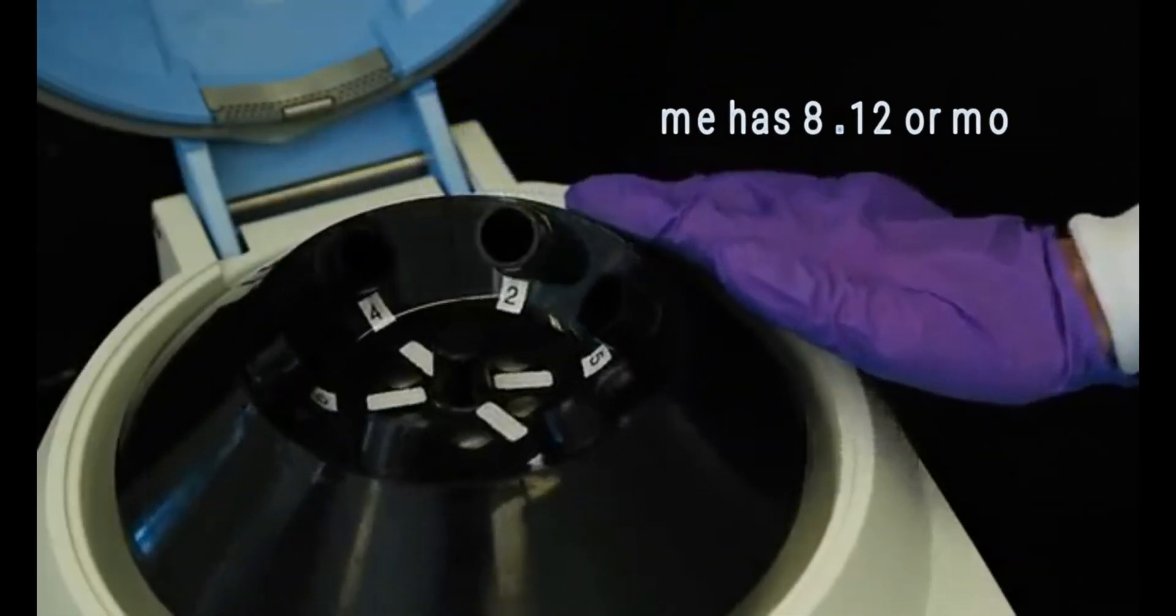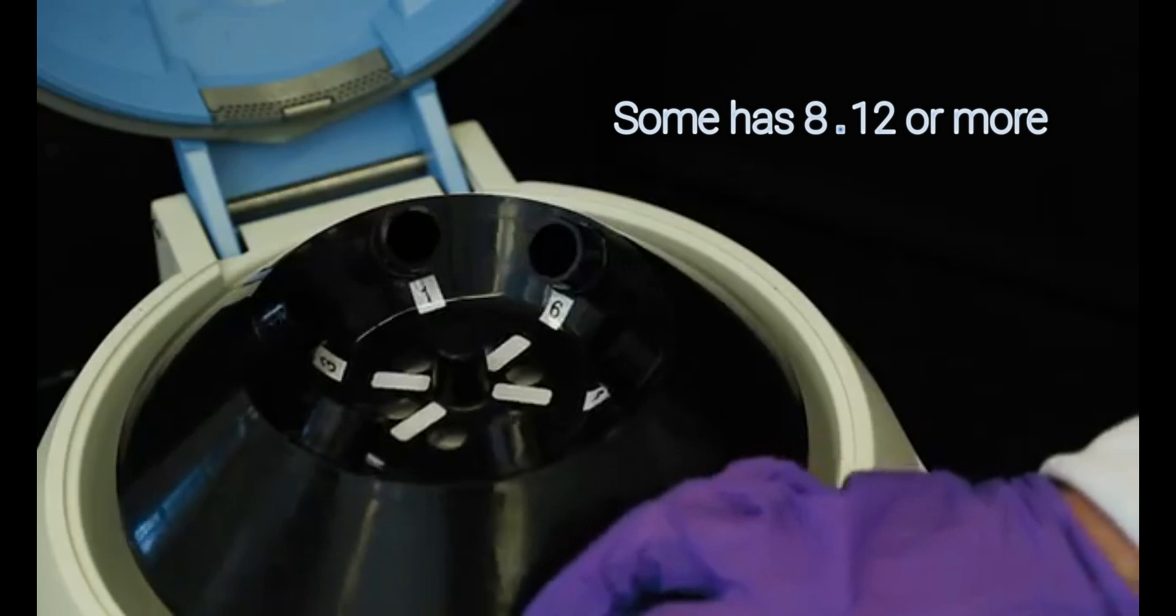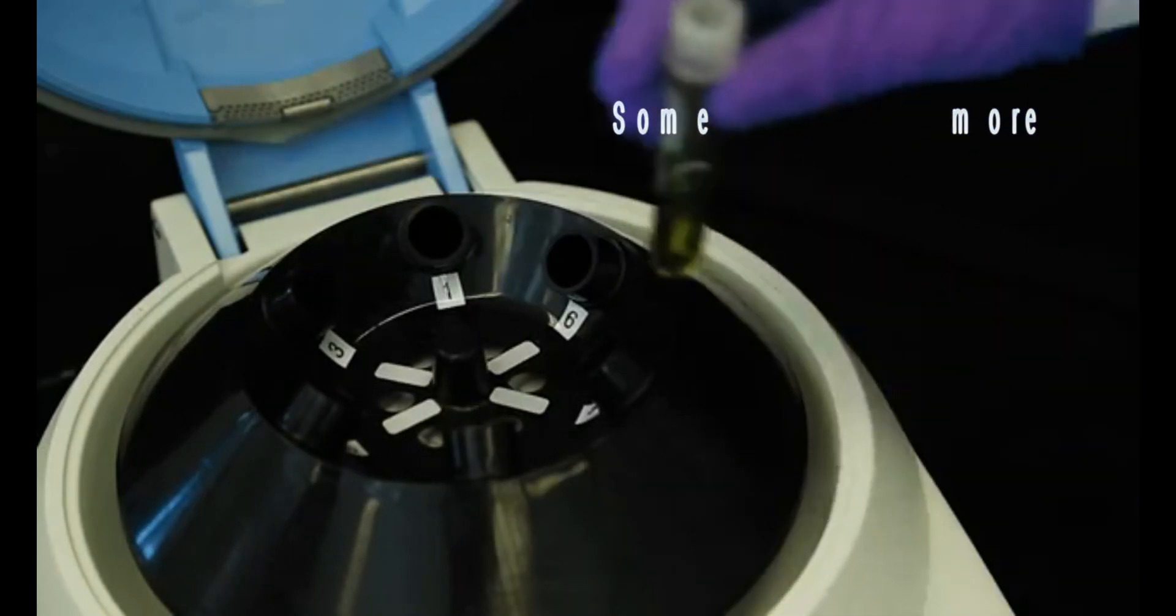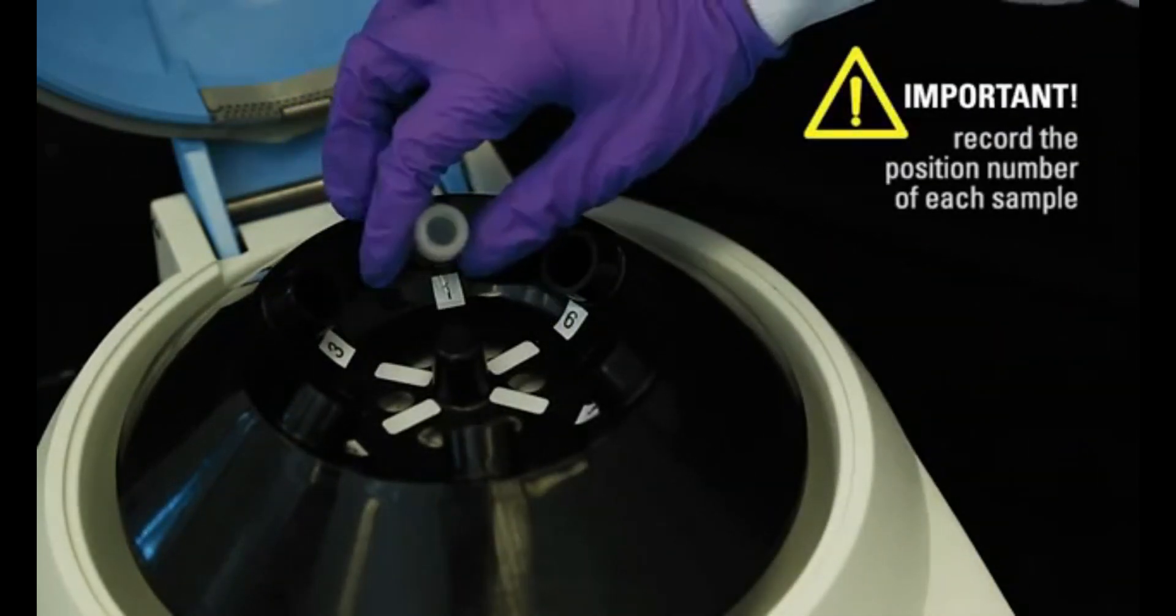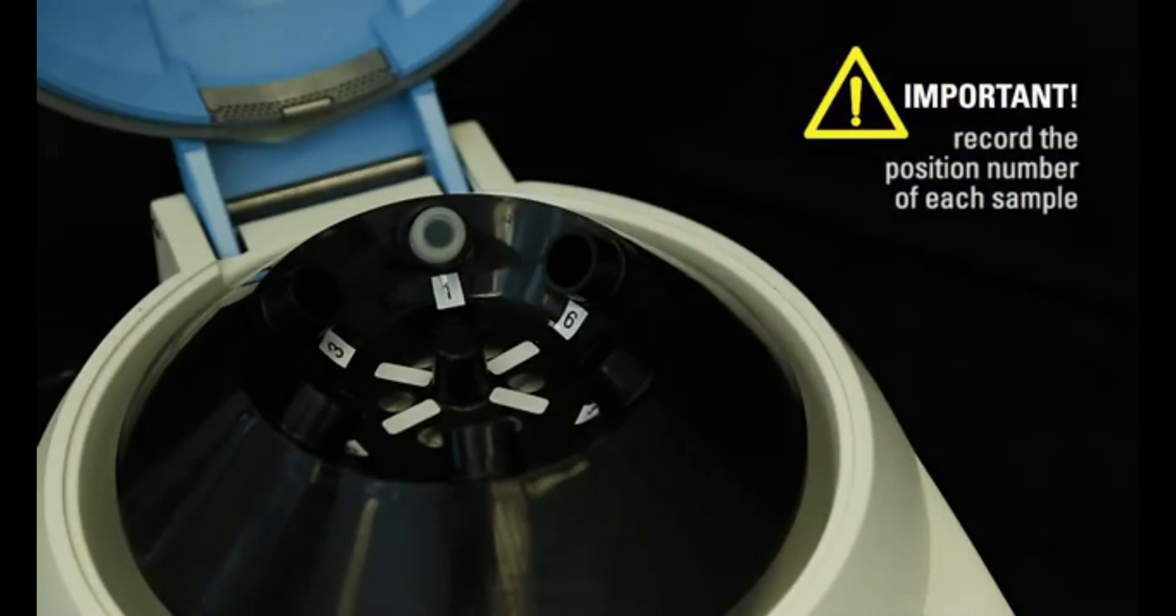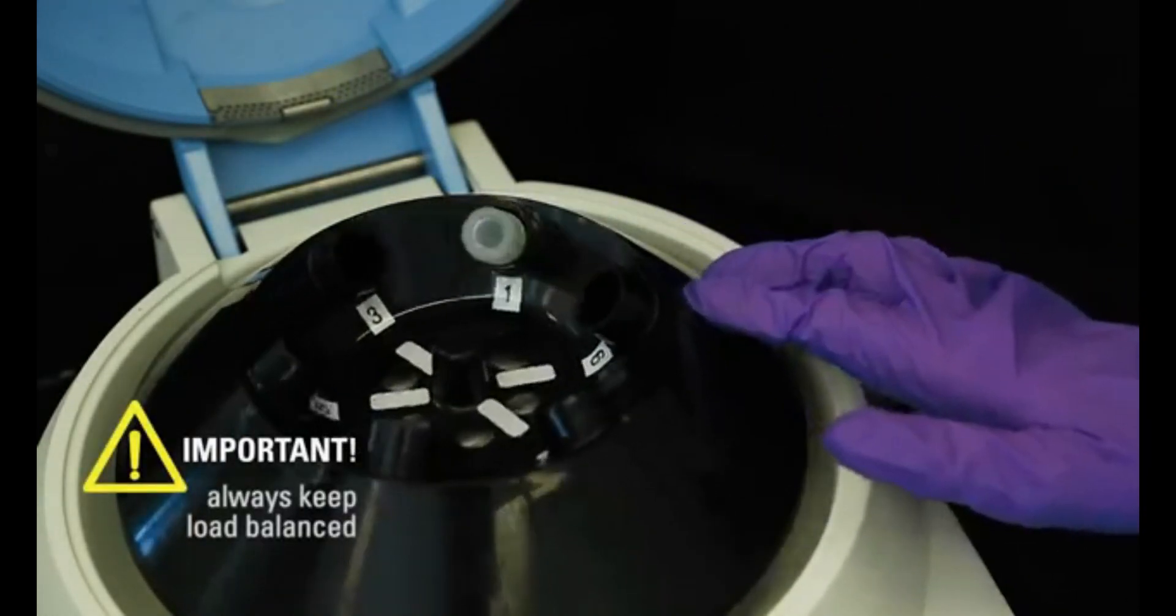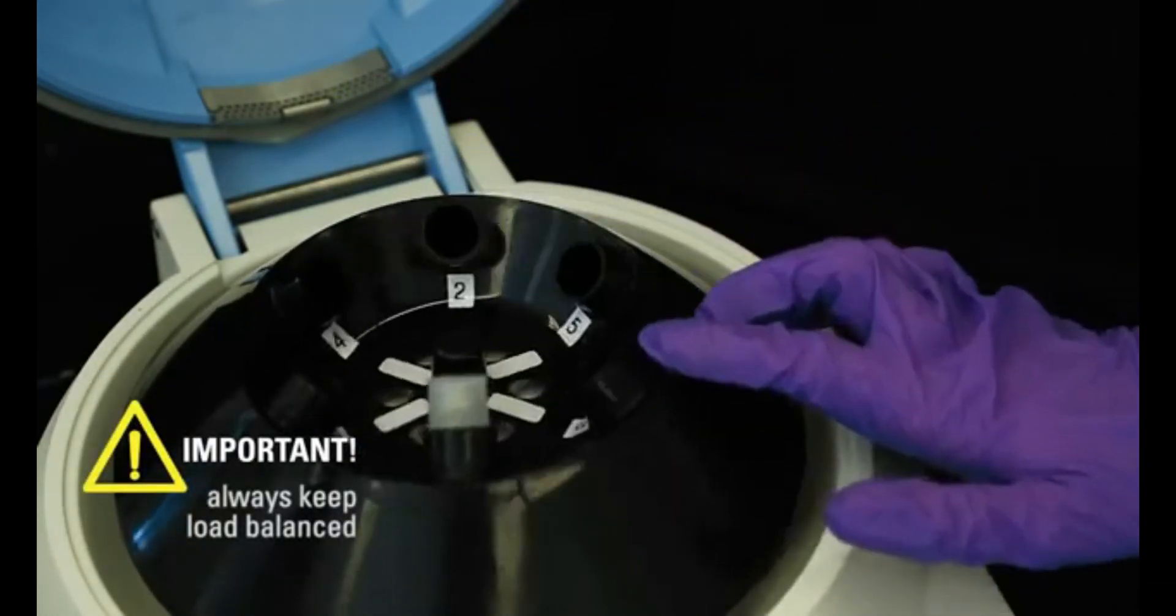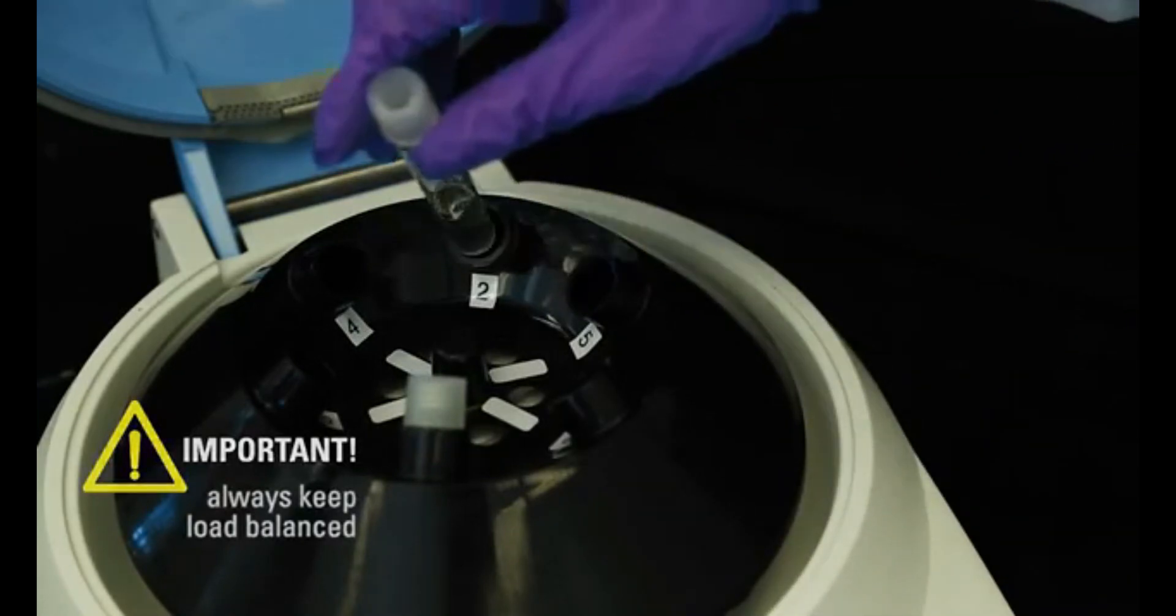Our centrifuge has six positions. All positions are numbered. When placing a test tube into the centrifuge, make note of the position number. Make sure every tube in the machine has a corresponding tube directly opposite to it for balance.